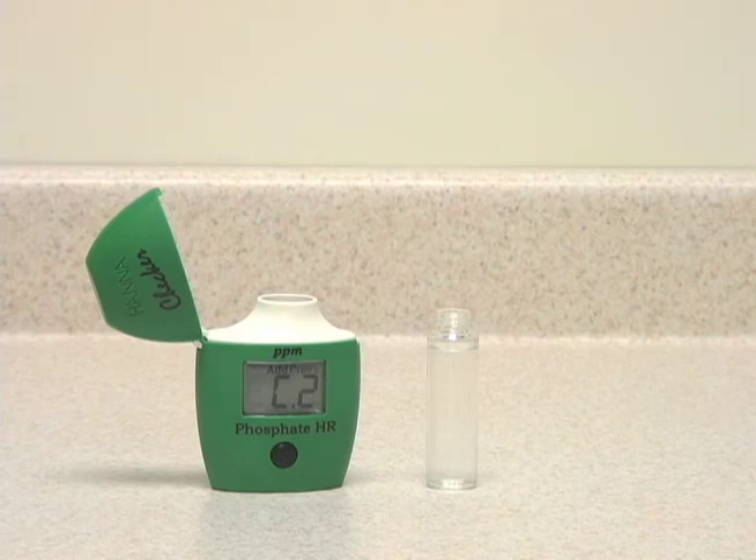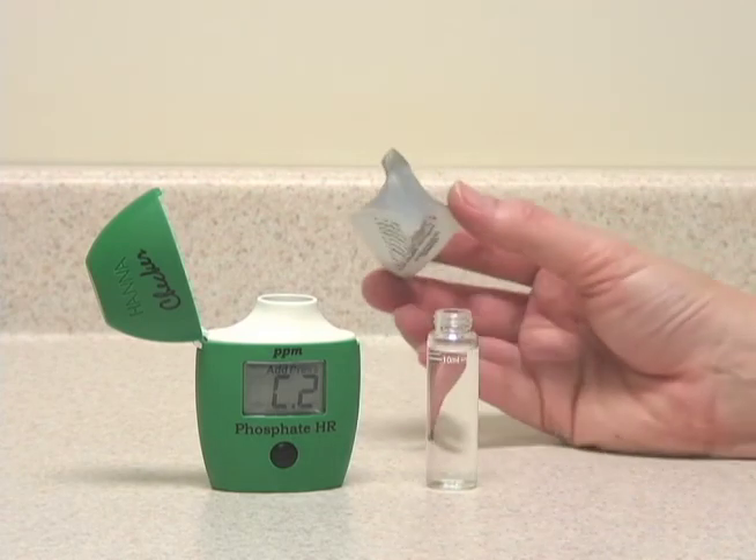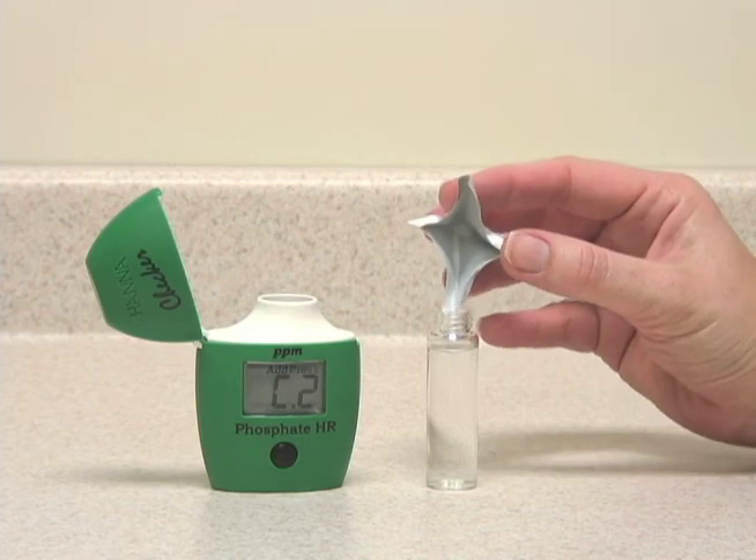The second part of the reagent is a powder, so we'll just add that.